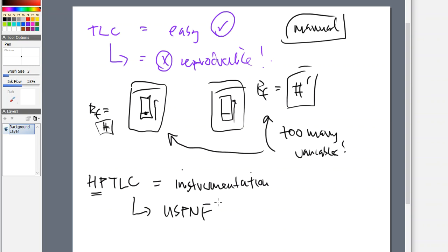We are going to be improving TLC and utilizing a little bit more of it. We are going to start placing HPTLC technology in the reference books on how to do the separation, all of the variables that made this problematic. We're going to control them, and we're going to tell you what to set your instrument to, so we can get better reproducible results.